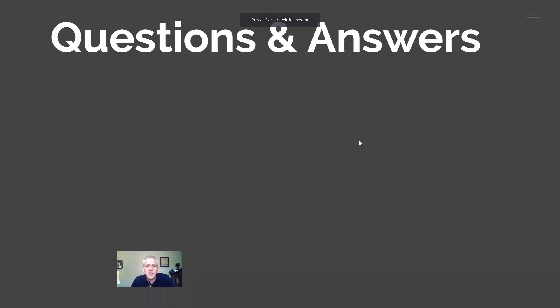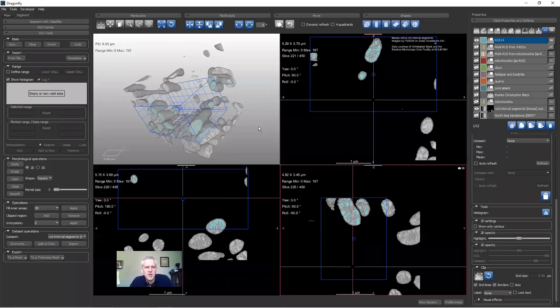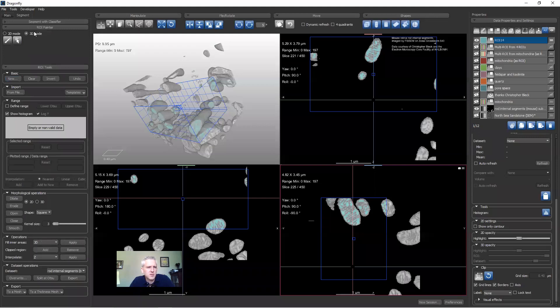Is there a region growing algorithm to create ROIs? Great question. There is the ability to grow regions in 2D using ROI Painter — we'll look at that tomorrow. There is also a watershed algorithm, which is a more complicated discussion. Both of those are region growing. The ROI Painter one operates in 2D mode.